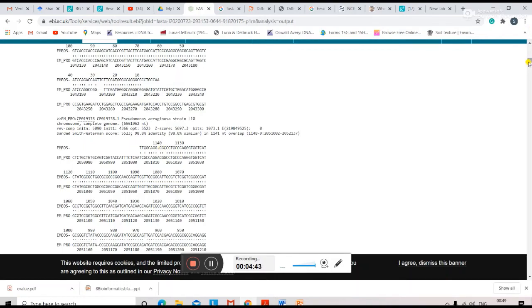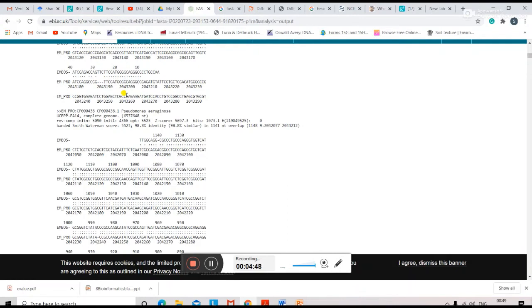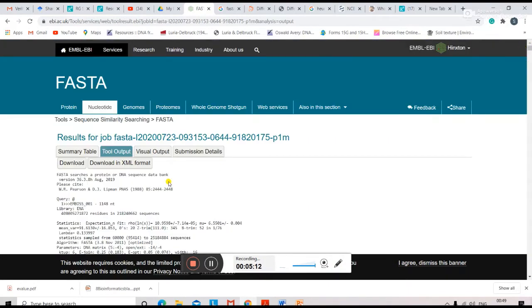In the case of FASTA sequence, on the FASTA analysis, you can find that. And see over here also they have put a gap, saying that so many regions are found to be different. Like they did a pairwise alignment, and once there are some sequences which are not found there, they have left some gaps over there. They give you a percentage similarity also, and you can see the visual output.